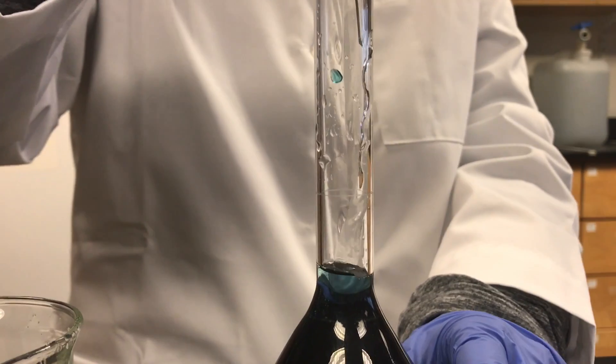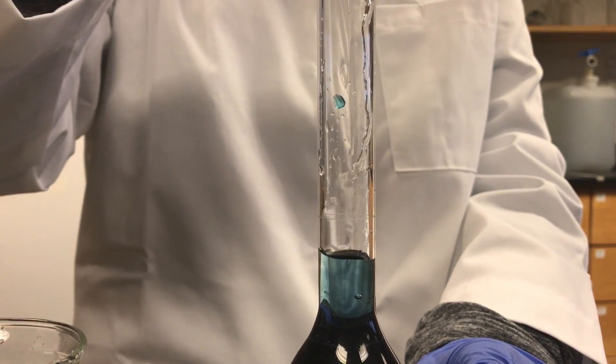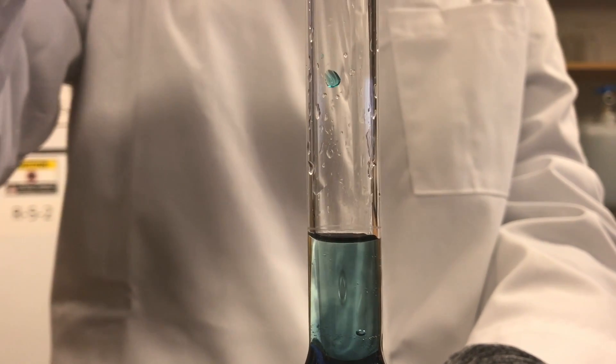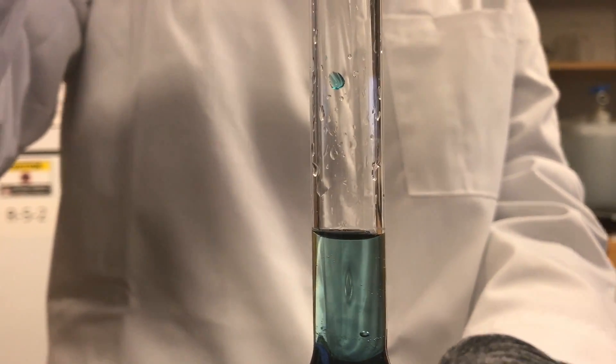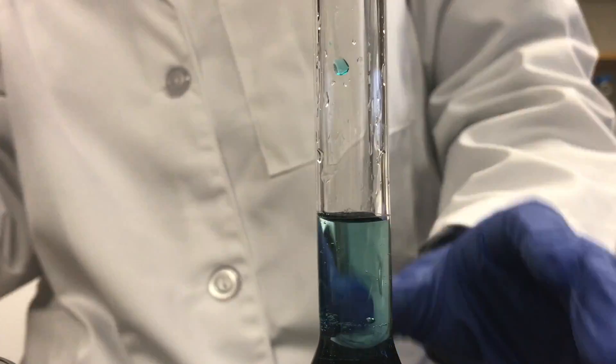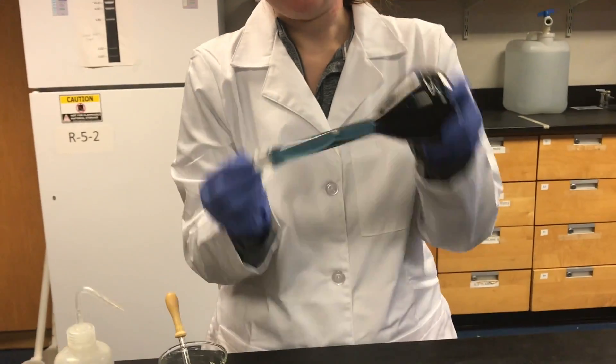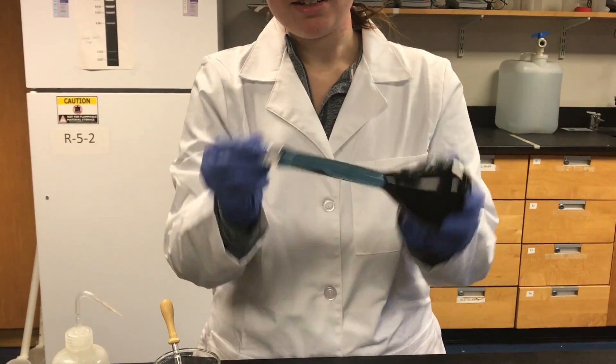When the liquid is close to the bottom of the stem, make sure to keep adding the DI water with a pasteur pipette only. This will ensure that you do not go over the line. The bottom of the meniscus should be right at the fill line. Finally, mix one last time, making sure the solution is homogeneous.